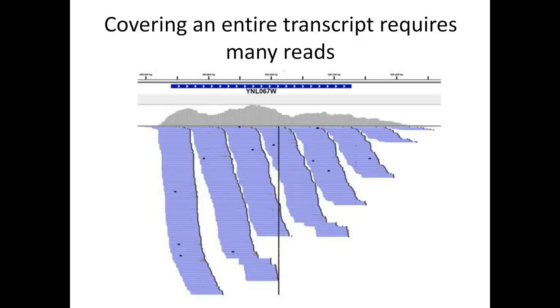And so for these samples, for RNA-Seq, we would obtain on the order of 10 to 20 million reads, which is good for yeast. Whereas for QuantSeq, to get an equivalent quantitative level of the transcript, you would probably only need a fifth of that, so say 2 million to 5 million reads. So it is more efficient in sequencing depth by maybe a factor of 5.